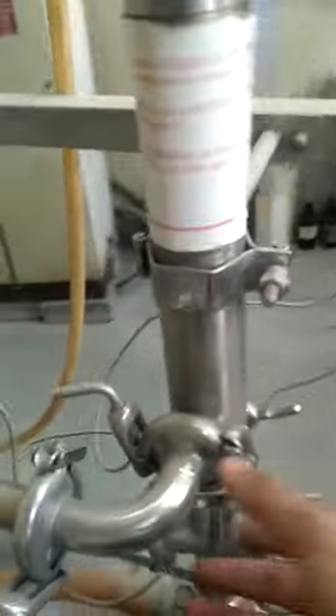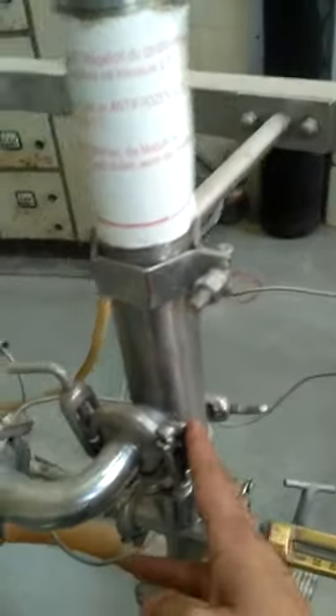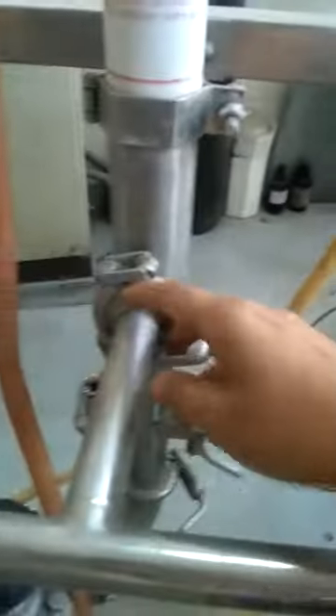Now on to the permeate side, here is the connection which is connected to the permeate side. And at the top side, there is one more connection. This connection is merged with another membrane's permeate outlet connection, and this connection is merged with the previous membrane's outlet connection.